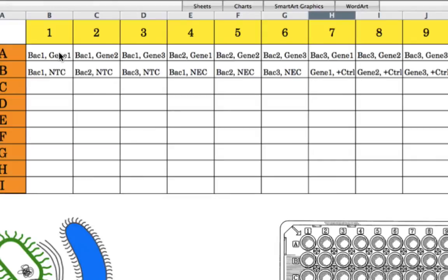Now imagine how much time you will spend just assembling these 18 tubes or 18 wells, and how many tips you are going to waste for each reagent, since every time you will dispose of the tips, and a lot of plastic waste. And of course, you'll have a lot of pipetting error, right? I mean, you are dealing with 1 to 5 microliters, 0.25 microliters. If you add such low volumes of liquid, there will be a lot of pipetting error. There can be a lot of variation from tube to tube. So to avoid all that, people create master mixes.